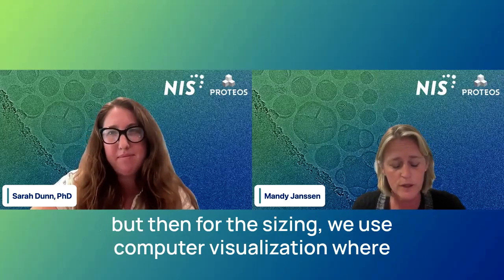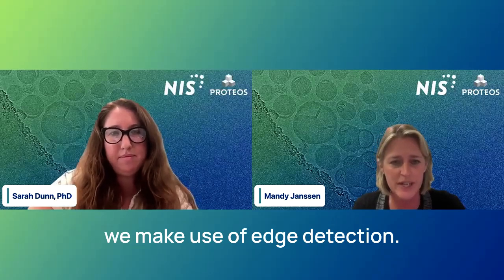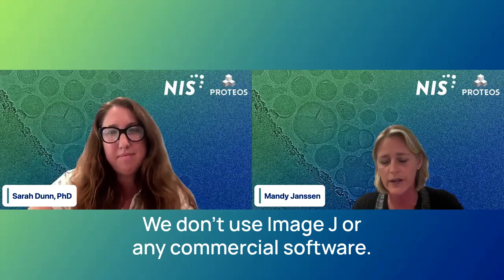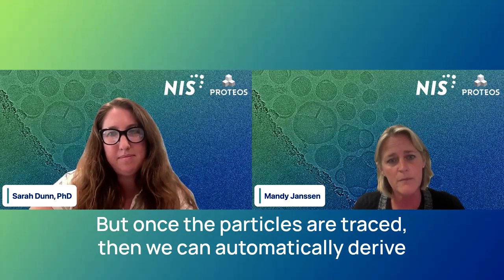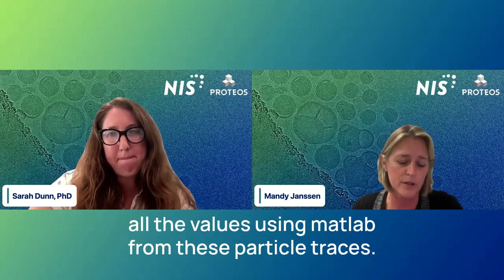But then for the sizing, we use computer visualization where we make use of edge detection. And I cannot share all these details. We don't use ImageJ or any commercial software. We make our own software in-house. We have our own software development team. But once the particles are traced, then we can automatically derive all the values using MATLAB from these particle traces.